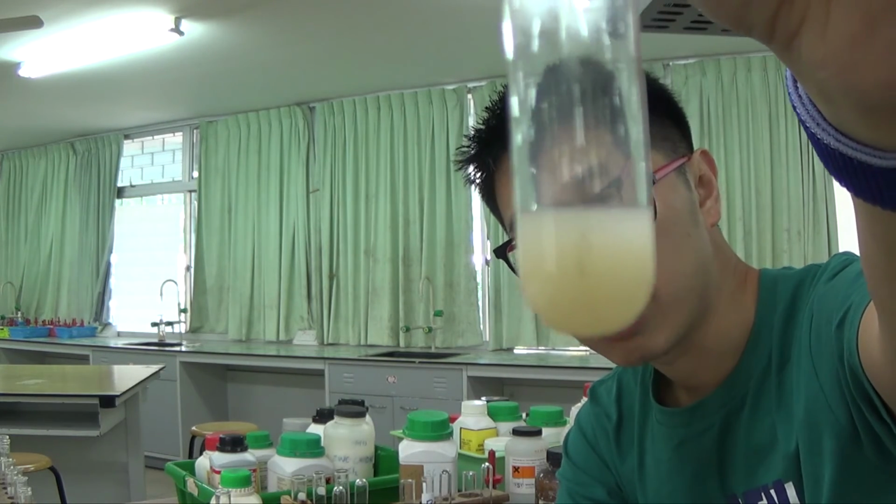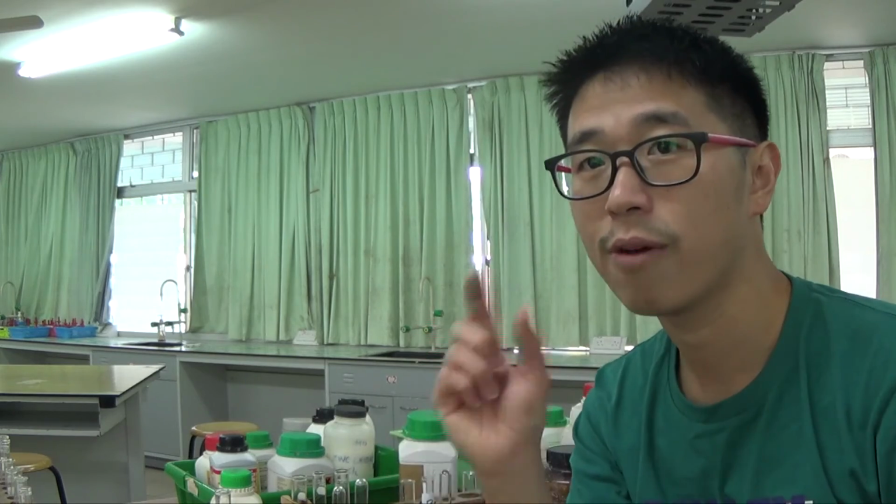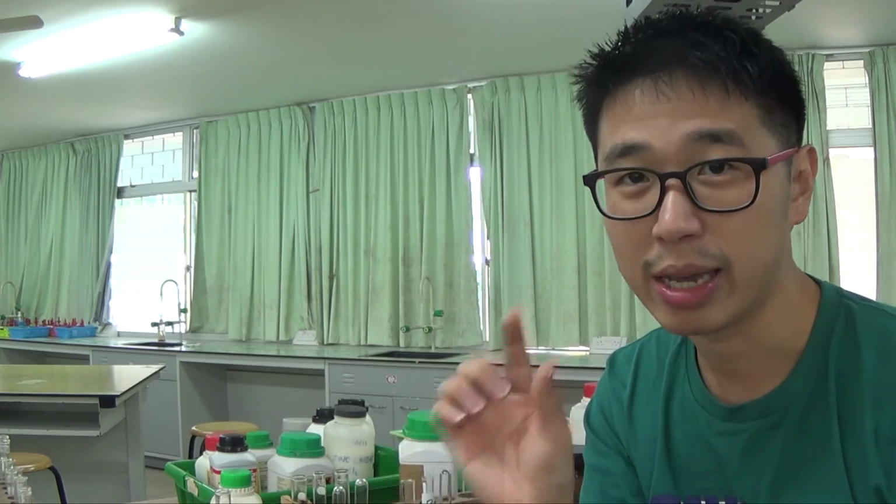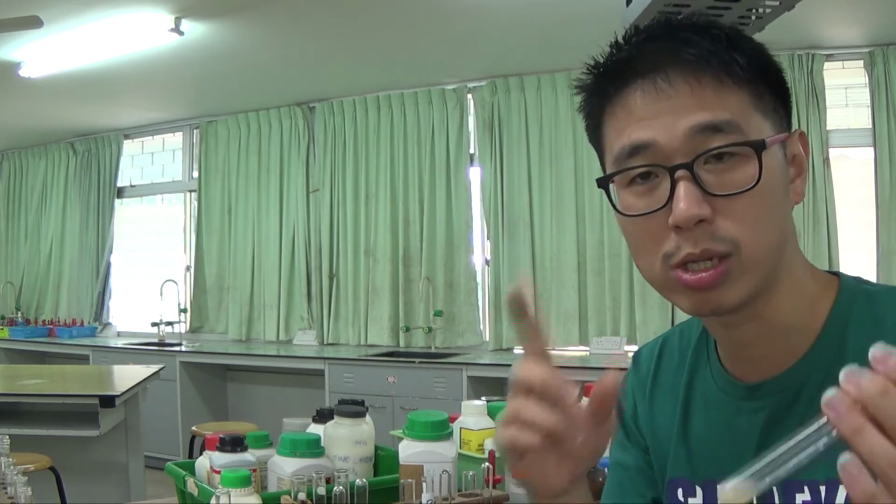That precipitate looks a bit orangey because of the presence of the iron 3+ in solution, Fe3+ aqueous, which was not a precipitate. I emphasize, it was iron 3+ aqueous. It was light yellowy, orangey brown, but it was a solution.